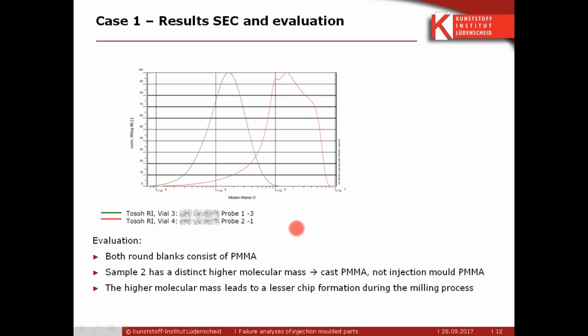An example is polycarbonate, where a 24 melt, low molecular weight, has a lower impact than a 12 melt with a higher molecular weight. Yeah, I guess you could agree on that. Yeah, this is what I've been talking about. If you would do mechanical tests on this kind of sample, you would also really see it.